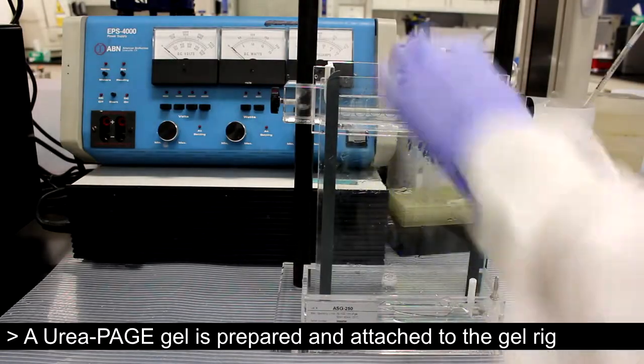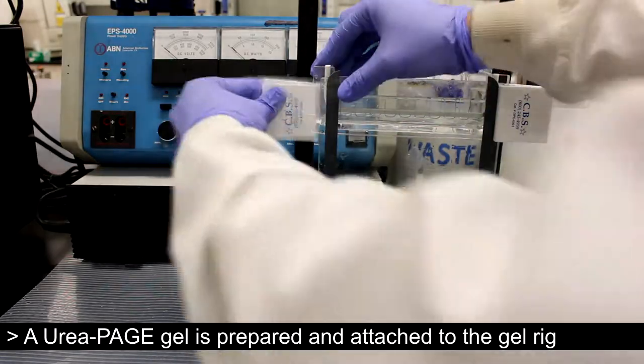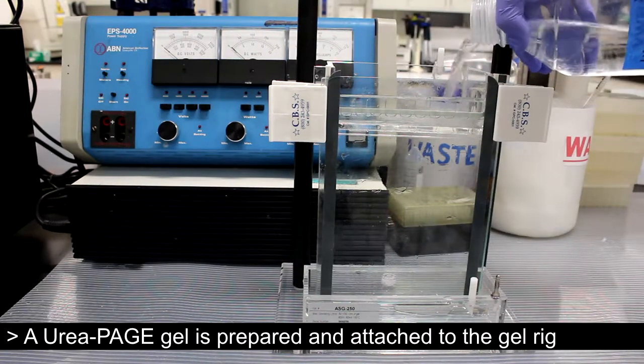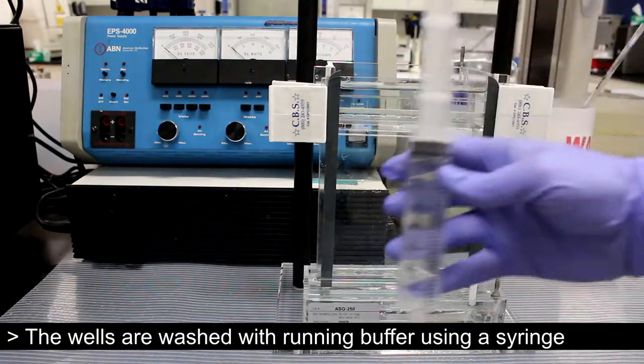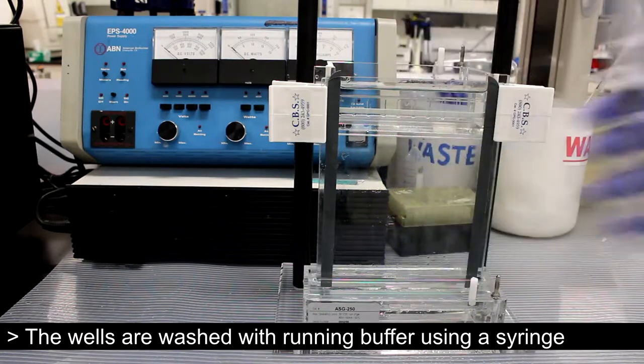To begin, a previously prepared urea gel is attached to the gel rig. The gel rig is filled with 1X TBE running buffer. The wells are washed with running buffer using a syringe.